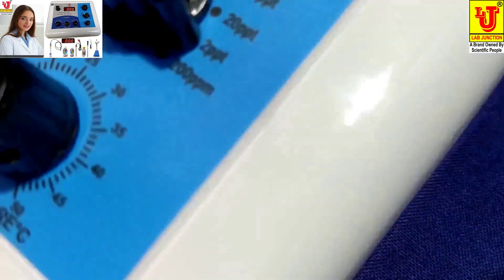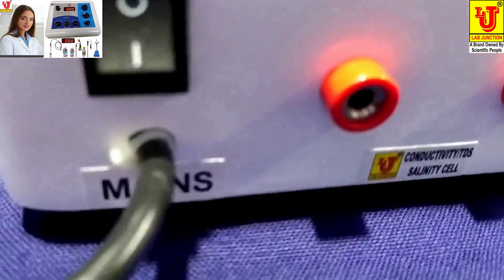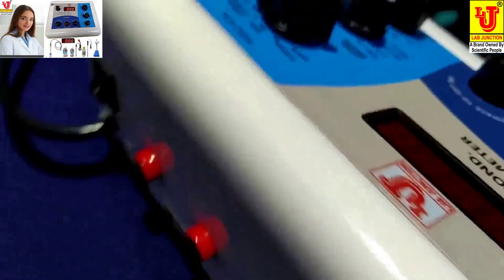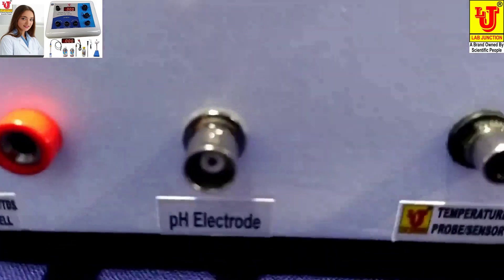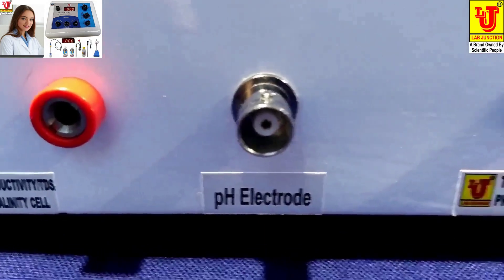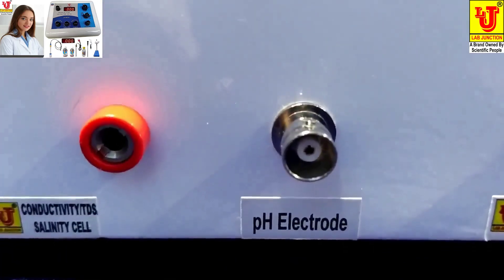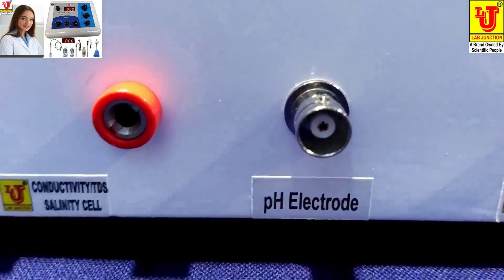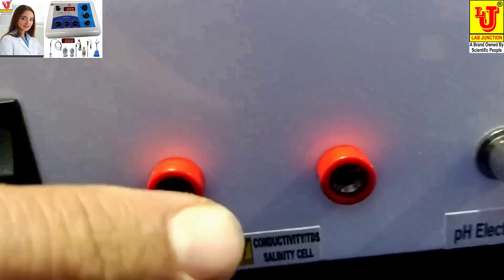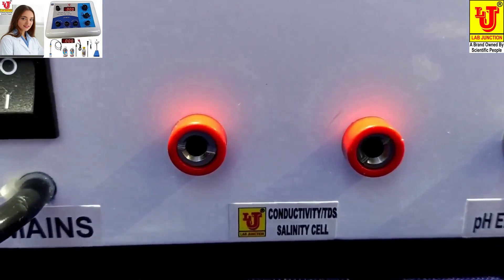This is the side control and back control. In the back control, first is the temperature sensor connector for inserting the temperature sensor. Next is the BNC connector for inserting the pH electrode. Third one is for connecting the conductivity/TDS cell sensor.